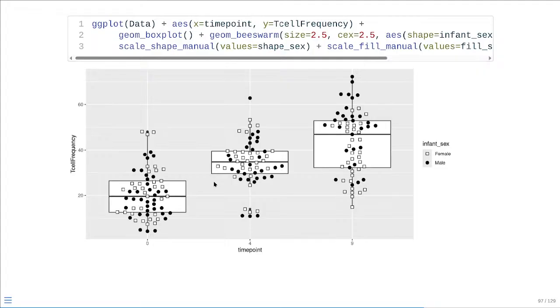But if this plot is going to go into publication and you're going to have many similar plots next to each other, it might be useful to have them standardized to start at 0 and end at 100 on the y-axis to keep them consistent across the board. So one way you can do this is we need to step back and zoom out the plot so that we're actually able to see it appropriately.